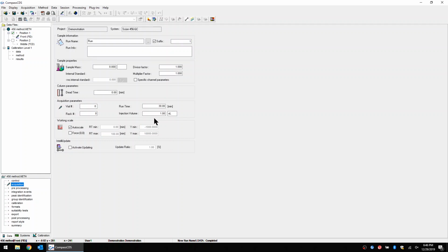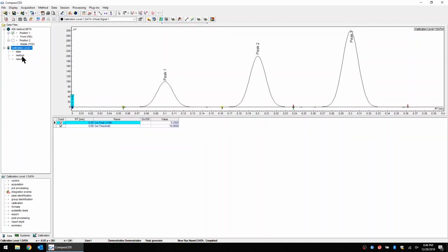The remaining subsections are most easily manipulated after a chromatogram has been collected. This is one of the most powerful features of CompassCDS. Chromatograms contain full copies of the global acquisition method. Local chromatogram methods can be modified without worrying about making irreversible changes. For example, new retention time windows, calibration tables, and integration events can all be tested within the chromatogram to see what effect it has on the data. Those changes can be applied to the global method if they are an improvement, or discarded.